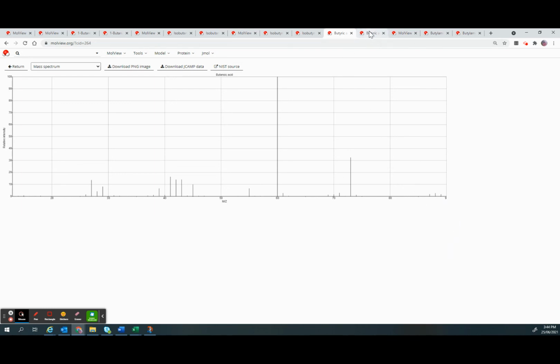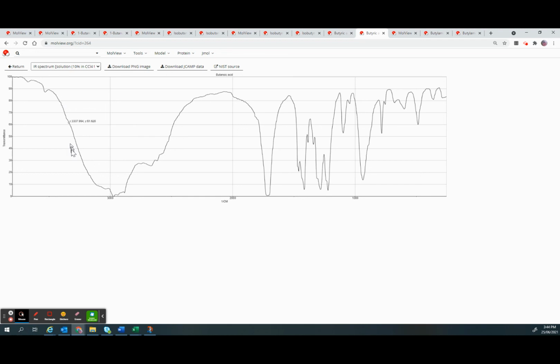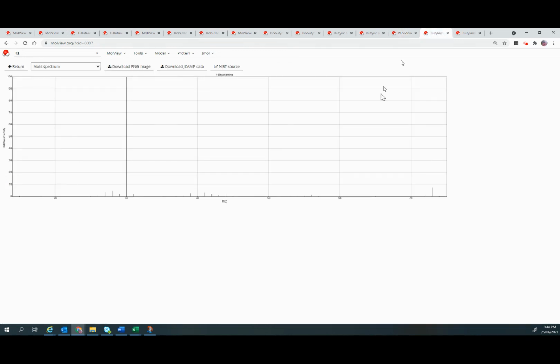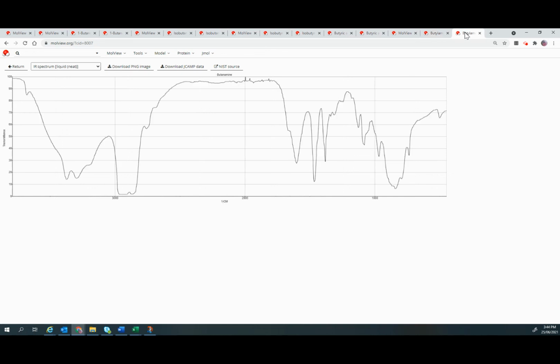I haven't looked actually. Here is now another isomer, which is the strong triangular peak. And here's now an amine. And very, very quickly, if we look here, it's now definitely an odd number for the amine. And finally, there's that 2-prong for the NH2 group, as well as the CH stretches over here.